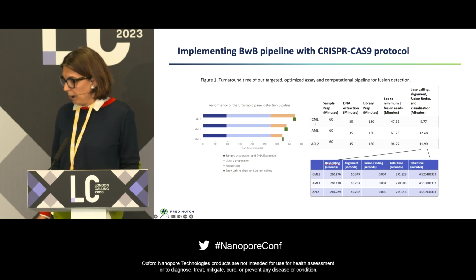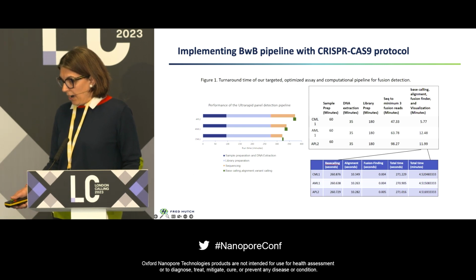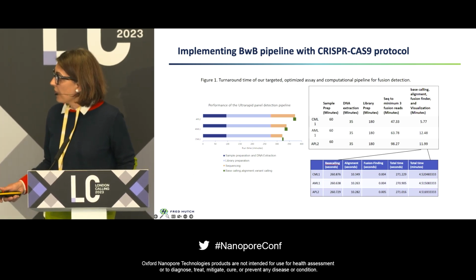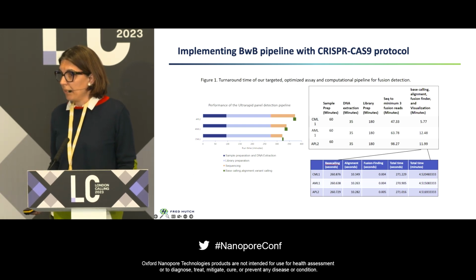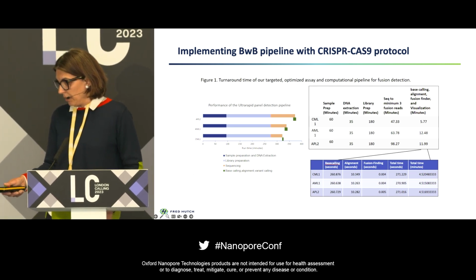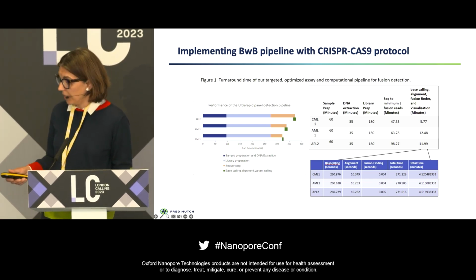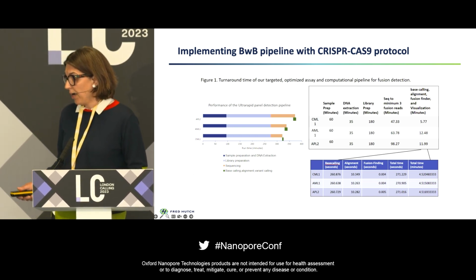So with this analysis and assay design, these are some of the timelines for analysis of the data. We decided 3 fusion reads was enough for diagnosis, and that's based on other platforms that we routinely use in the laboratory for patient diagnostics. The dark blue block is the time we spend from receiving the blood specimen to the DNA extraction, and the light blue shows the library prep time.